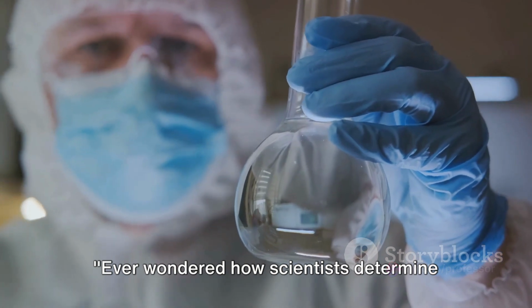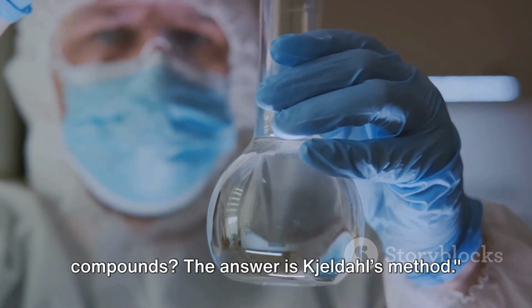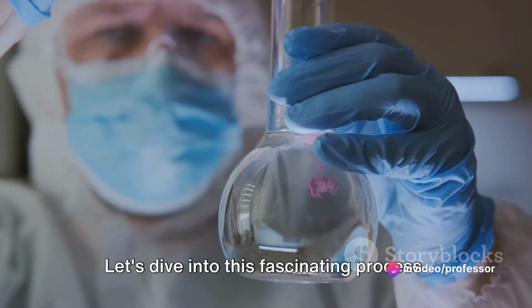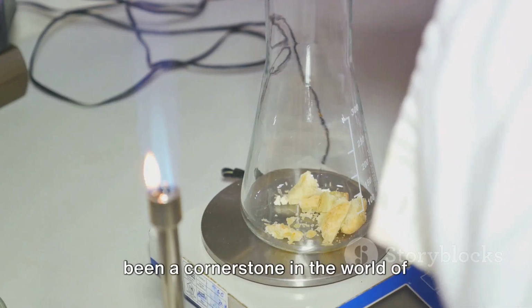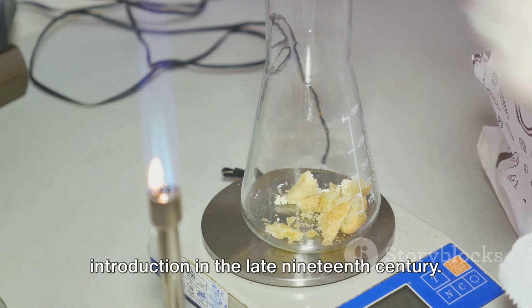Ever wondered how scientists determine the amount of nitrogen in organic compounds? The answer is Kjeldahl's method. Let's dive into this fascinating process. Named after its inventor, the Danish chemist Johan Kjeldahl, this method has been a cornerstone in the world of analytical chemistry since its introduction in the late 19th century.